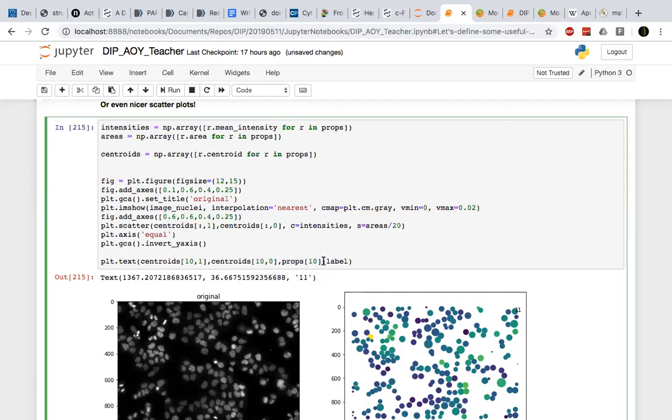So why do you want to do that? That's essentially how we do it. The imaging process right now is we use this program that doesn't work that great, so I'm trying to imitate it. Which program? EZX analyzer. When it outputs the image, it will label each cell with a particular number that it corresponds to. Right, it does the same thing. Okay, that should work. Sorry, for some reason I got the error from here. I could not solve it from scratch actually.